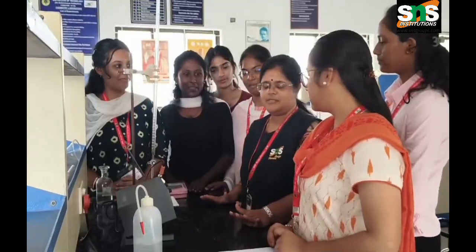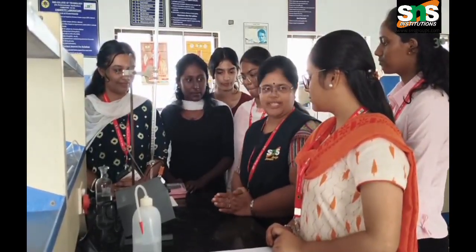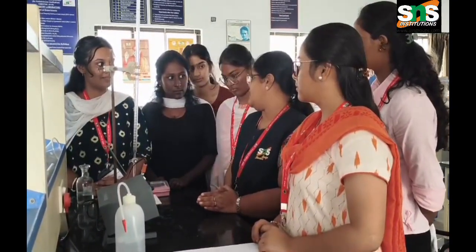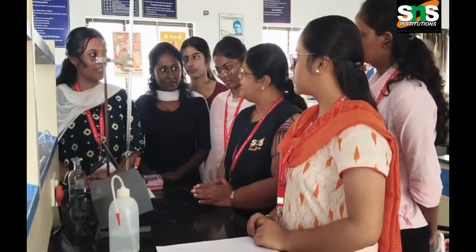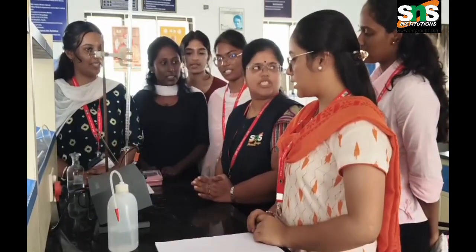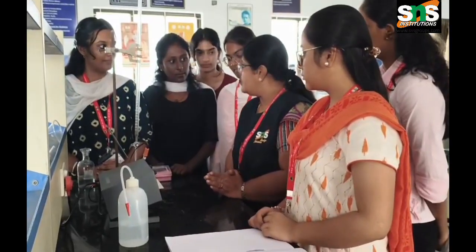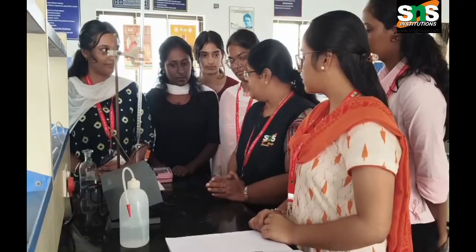Good afternoon. Today we will see the conductometric titration for a mixture of acids. What is acid-base titration? What will happen when an acid is titrated against a base? What type of reaction is it? Neutralization. So the reaction is called a neutralization reaction. Here we are going to find out the amount of acid present, and for that we are using conductometric titration.